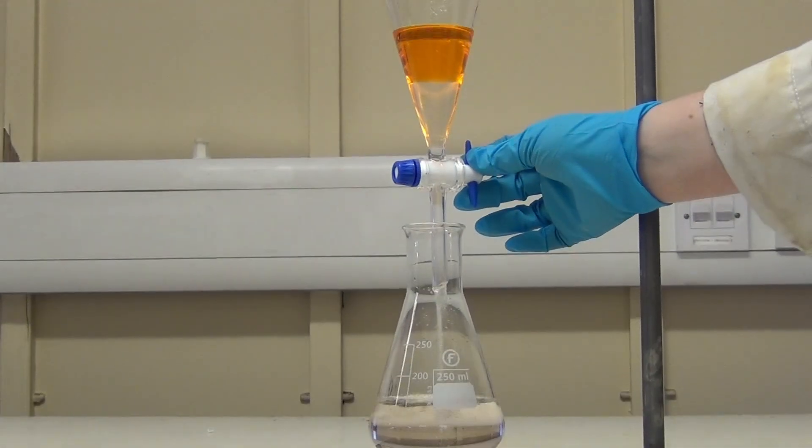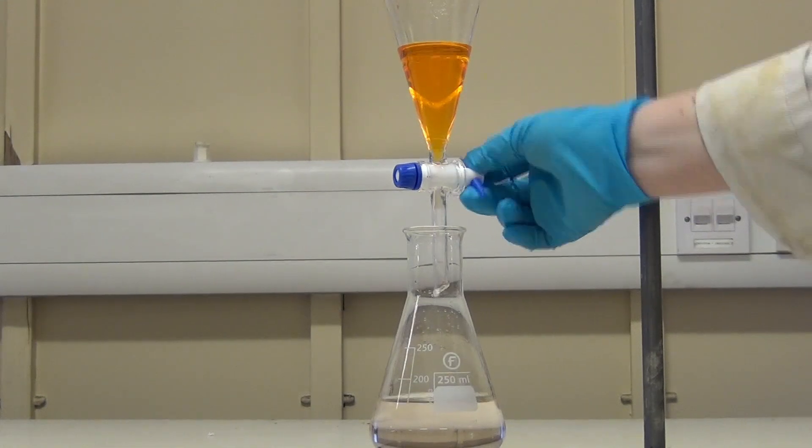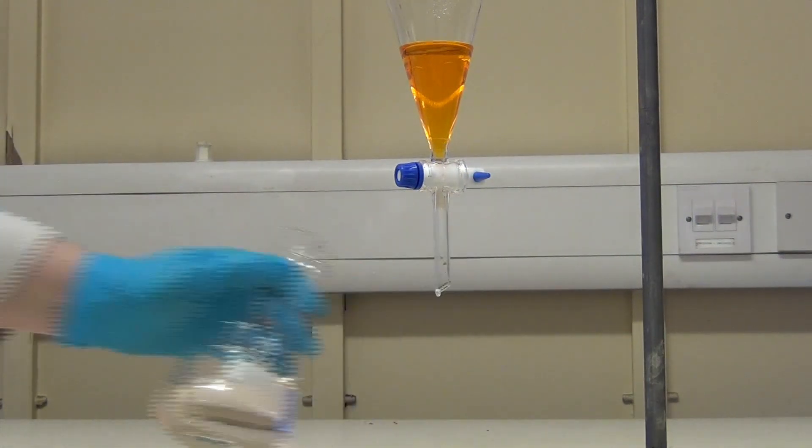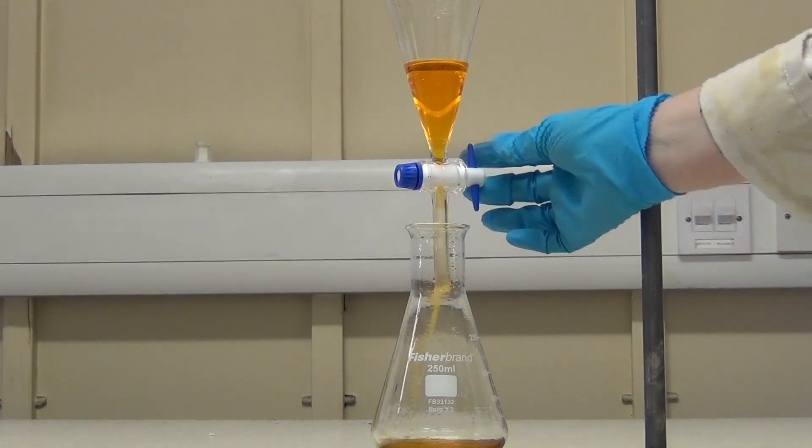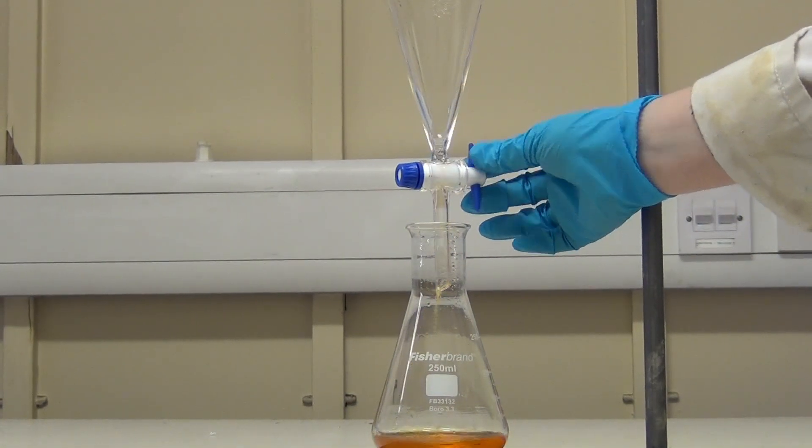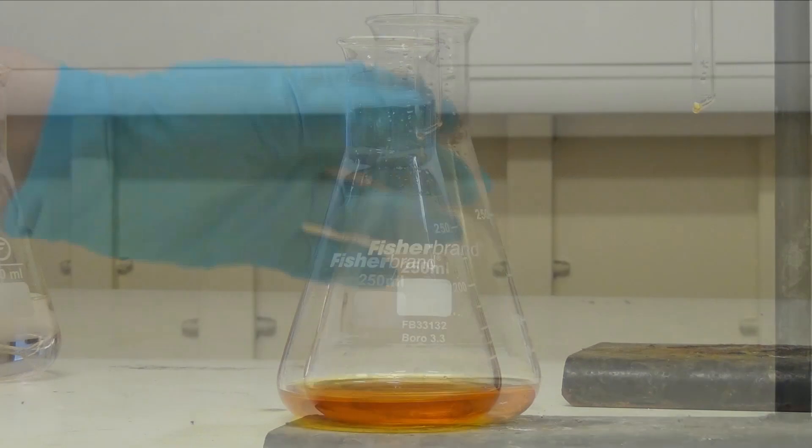And it is better to collect the layer that you want, in this case the organic layer, into a new, clean, conical flask after each separation. By repeating the extraction process, it ensures maximum separation and therefore helps to maximise the yield of your final product.